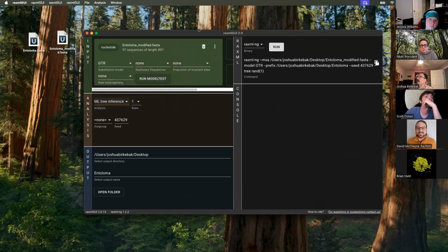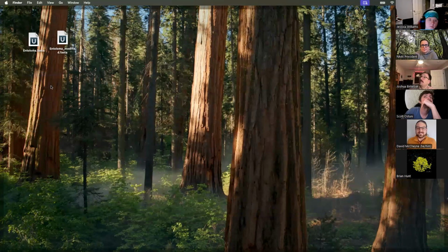Let's do a sanity check tree before we do too much. Oh, this is going to make a mess of my desktop. Never mind. We're going to make a new folder. You might need to run the model test again. Oh, you're right. I need to run the model test.